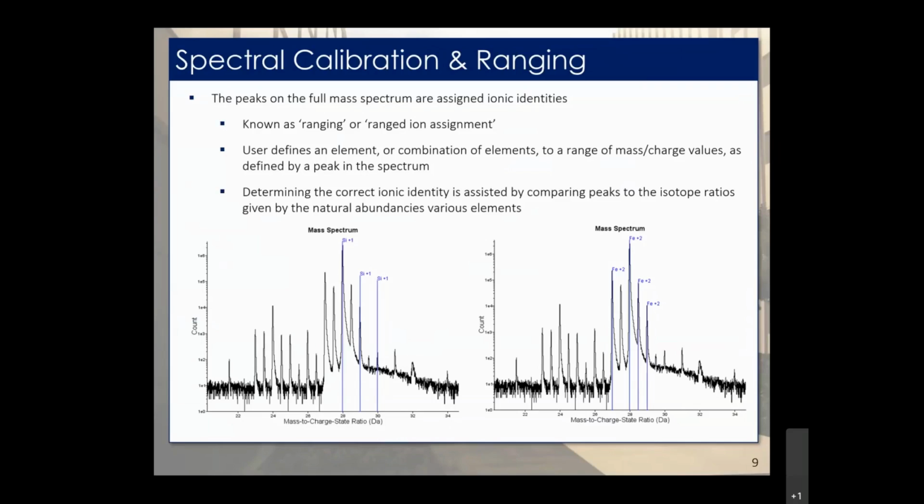And what we can see from our actual mass spectrum is that we basically don't get to that point. In other words, there's not enough of those peaks for that 28 peak to be entirely made of silicon.